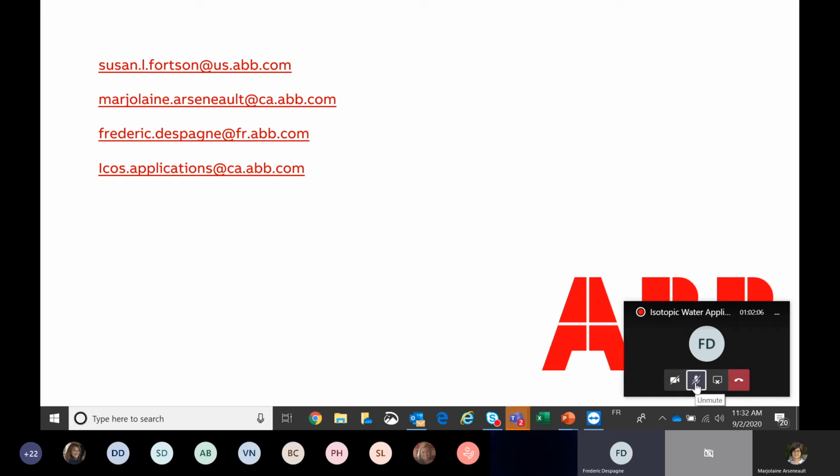From the performance point of view, the way the spectra are recorded between cavity ring down and ICOS spectroscopy is also quite different. Basically, the laser for cavity ring down spectroscopy measurement is locked to successive modes. So you don't have a continuous description of the absorption bands in the infrared spectrum. You have a very digitized spectrum, which is okay as long as you don't have interferences.